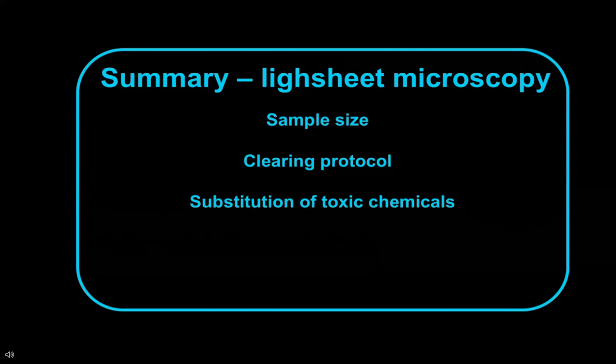Then you can also consider substituting some of the toxic chemicals. For example, the dibenzyl ether, which is the last step of the iDISCO+ protocols, because this will be the liquid that you use in the microscope also.